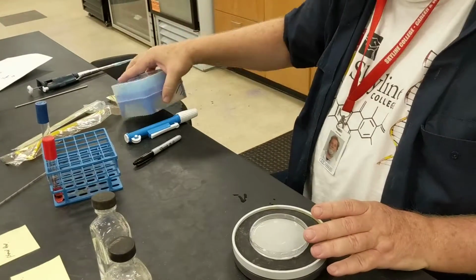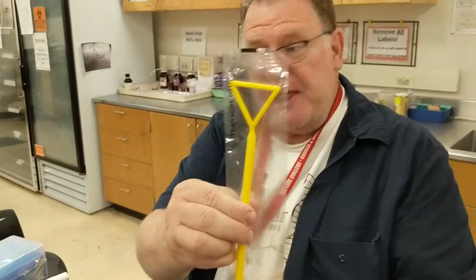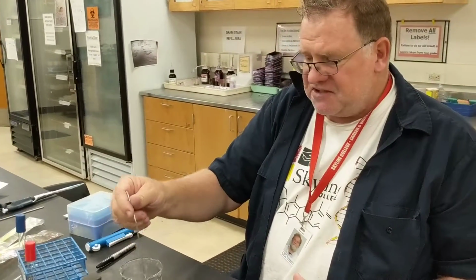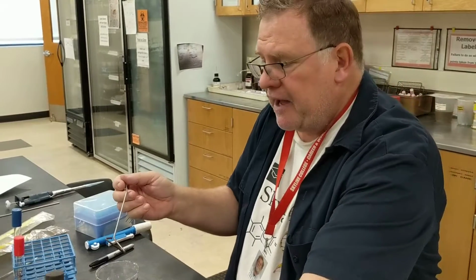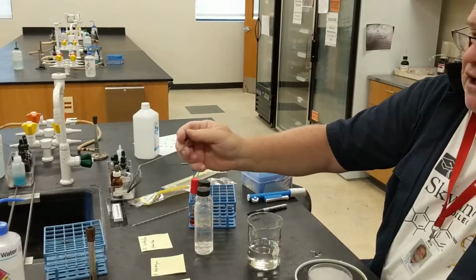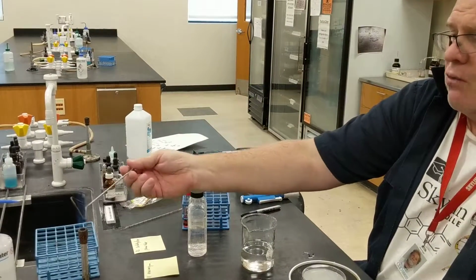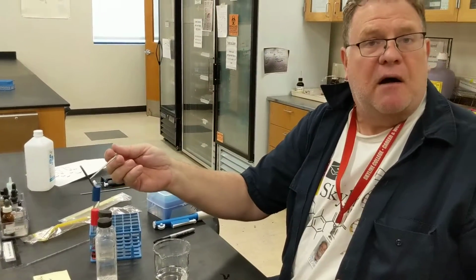I'm not doing that now. You can either use a disposable plastic spreader bar, or in this case, I have a spreader bar that's in some alcohol, and it's 70% alcohol that actually sterilizes it. Now I need to get rid of my alcohol so I don't kill my culture. So what I will do is burn off that alcohol. If you can see, I'm burning off the alcohol. I don't want to do it too much because I don't want my spreader bar to become hot.